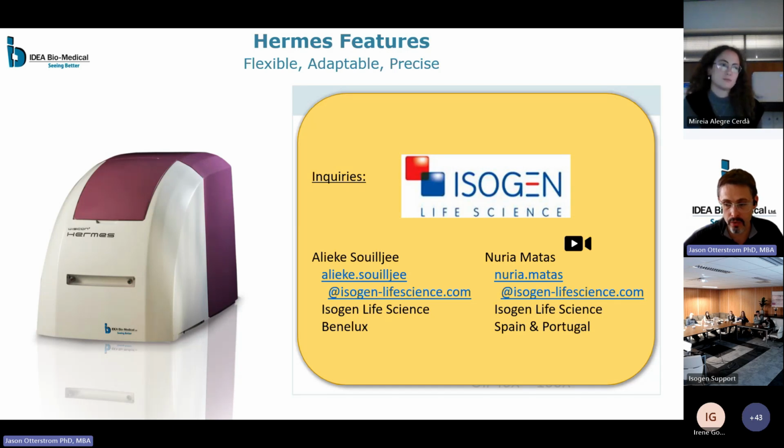Any of the magnifications that we support can be used with round bottom plates. However, as I mentioned before, sometimes the round bottom plates are a bit thick, and so high numerical aperture or high magnification objectives may not go through the sample just because of the working distance of the objective. But the autofocus is not a problem at all for round bottom.